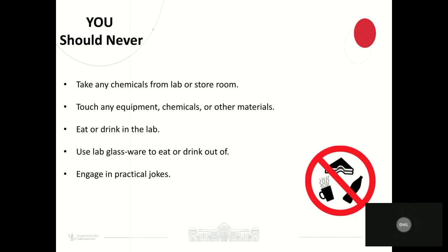You should never take any chemicals from the lab, touch any equipment or chemical or other material, eat or drink in the lab, use any of the glass equipment to eat from, or engage in any practical jokes.